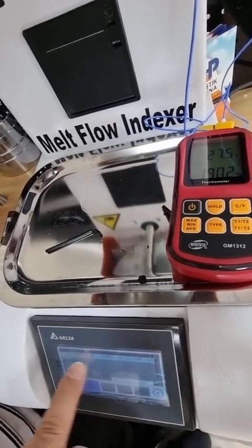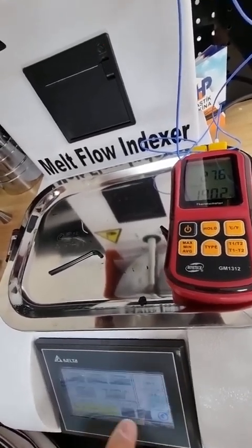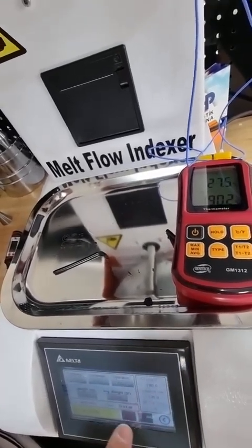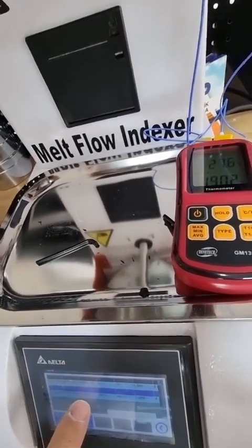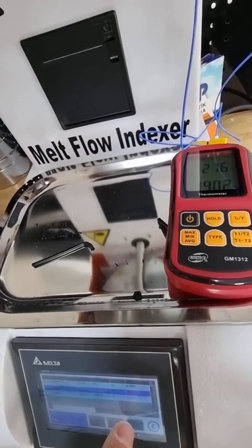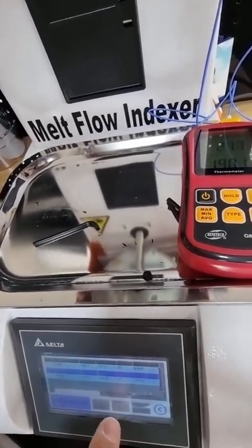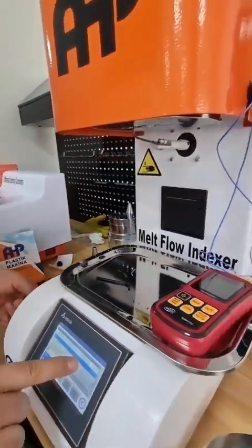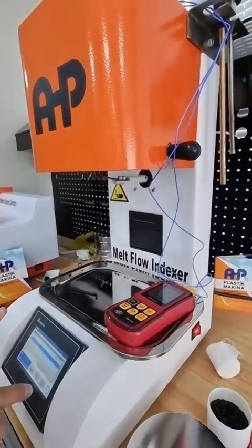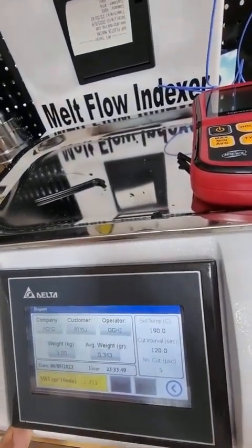In the saving page, you can set parameters such as company name, customer, and operator. Date and time are saved automatically. Click save to create a new row including date, time, company, customer, operator, sample weight, melt flow rate result, and number of cuts. Insert a flash drive and click 'Export to USB' to get an Excel file with all this data. This is the basic melt flow index tester from AHP Plastic Makina — don't forget to follow us on social media and YouTube. Thank you and goodbye.